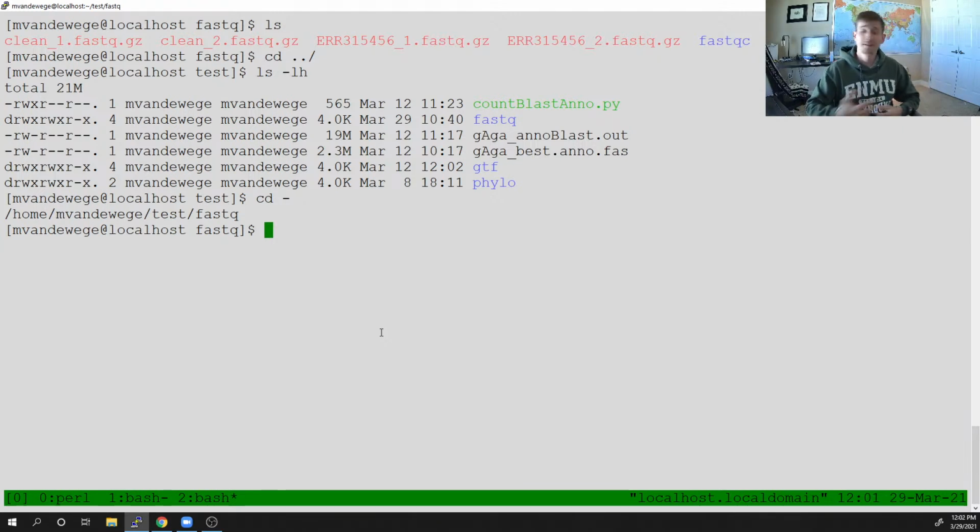We're continuing with how we can analyze RNA-seq reads. Generally, there are two pathways we can choose to go down, and it depends on whether there's a reference or not. If there is a reference, for example, we know all the CDSs that exist in a species, there's a reference on Ensembl, there's a reference on NCBI, what we would do is just clean our reads up and then map them back to the reference and start counting.